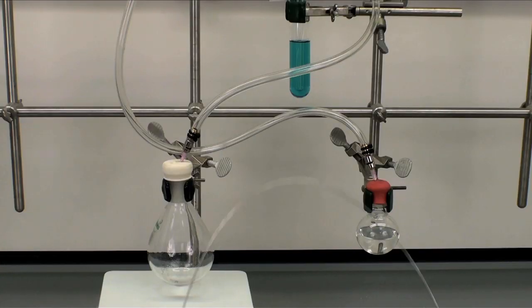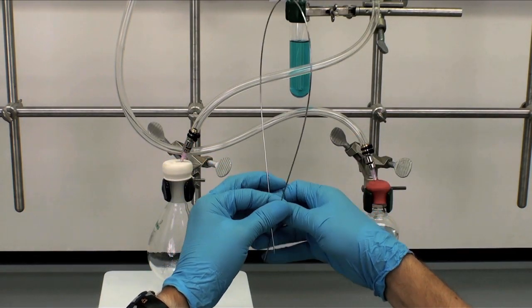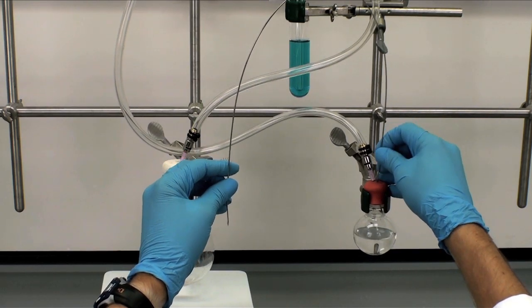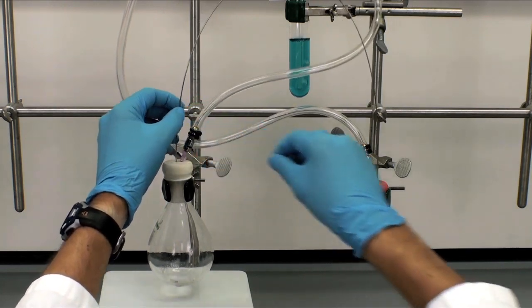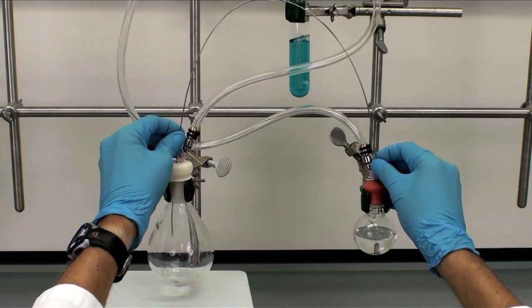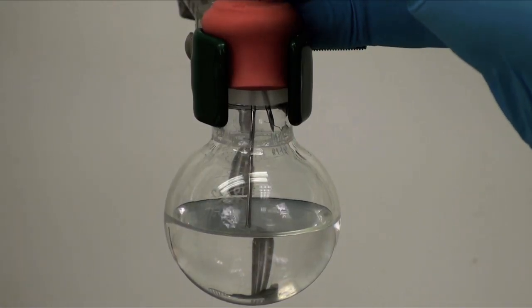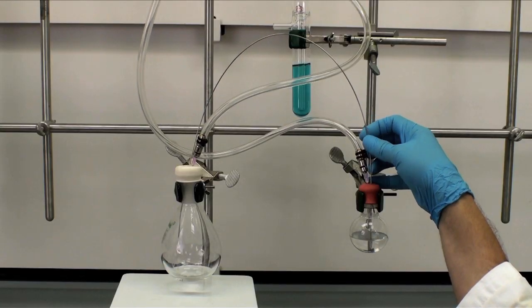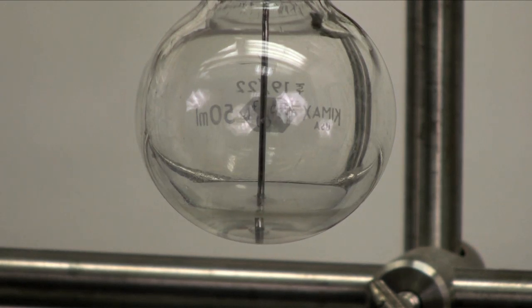Here, let me show you how to use it. First, I place the flask under nitrogen. We need to puncture the septum with the sharp end and then insert the blunt side through the hole. Notice that the cannula is not touching the liquid yet. The receiving flask is already equipped with a bubbler, and now I can insert the cannula into the flask. Lowering the blunt end into the solvent will cause the liquid to flow, and you can actually control the rate. As I mentioned before, lowering the blunt end all the way allows the last of the liquid to be transferred.